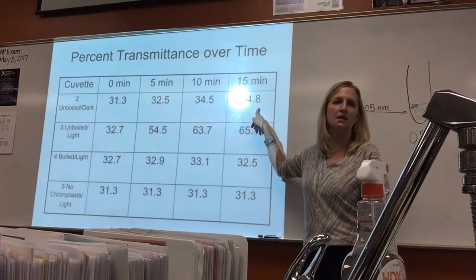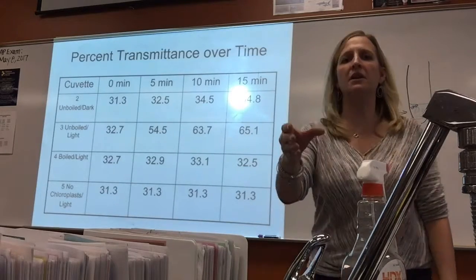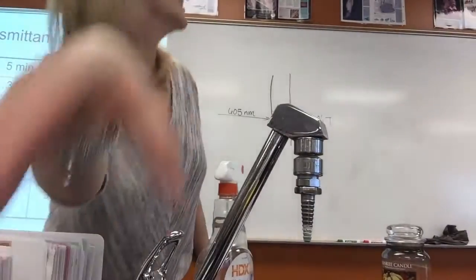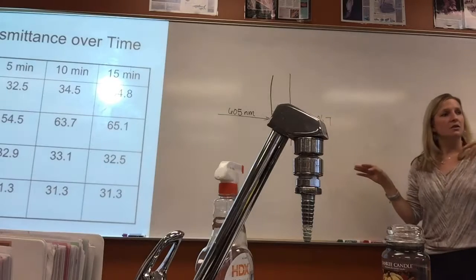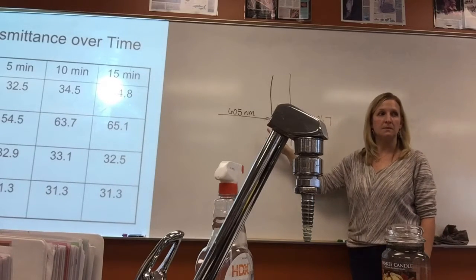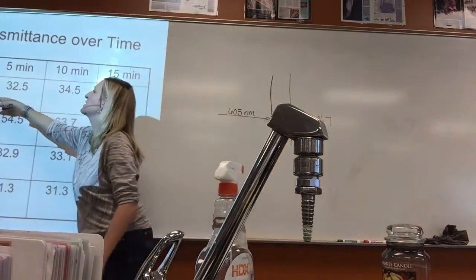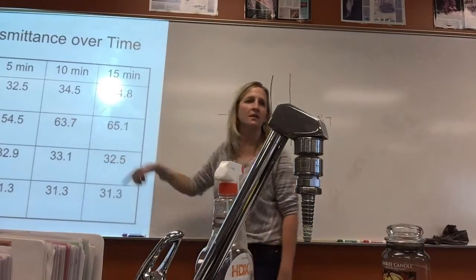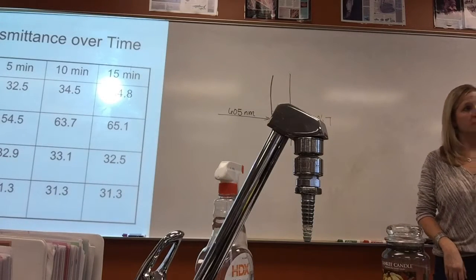What does that mean? So how does that relate over here to the DPIP? Charlie? Sorry, what are you asking specifically? What does the increase in transmittance here mean? Oh, that means that the DPIP was becoming more clear, some of it was being used.